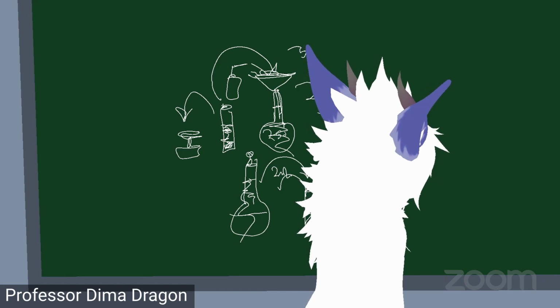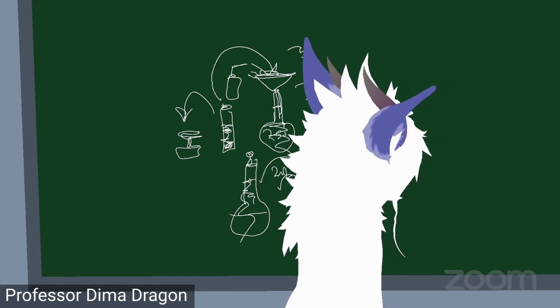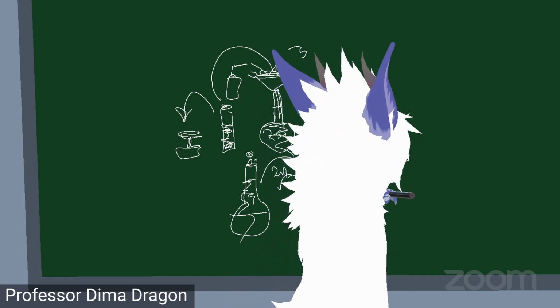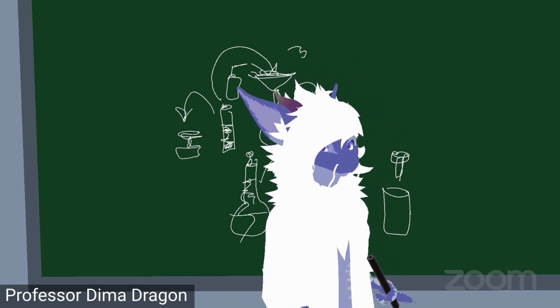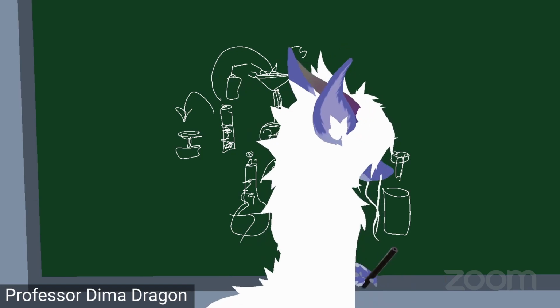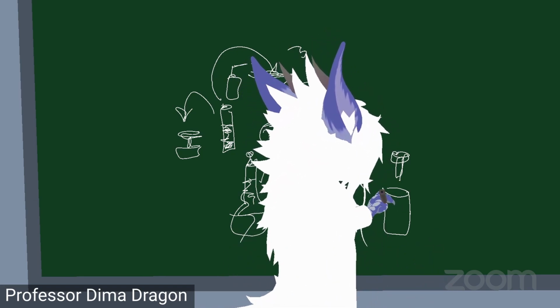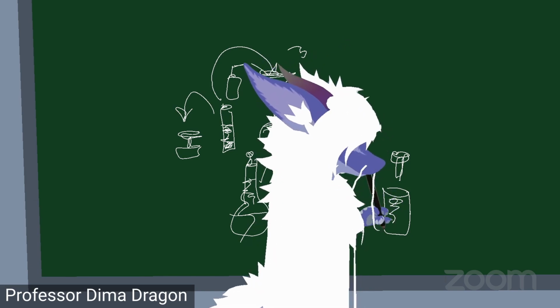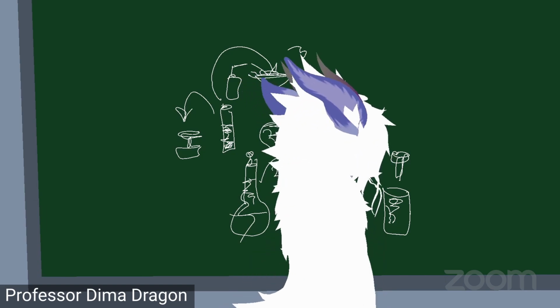So you're going to have a filter vial. Its cap is going to look like this, and the vial itself is going to look like this. You're going to put your name and group number on this, because I'm going to be loading this with other classes' samples too. So put your name, group, whatever. You guys know which group you are.